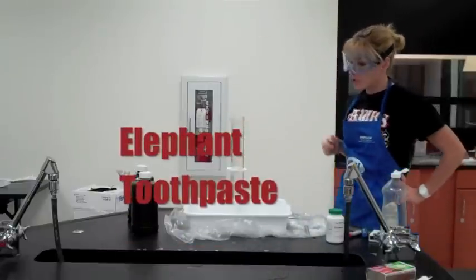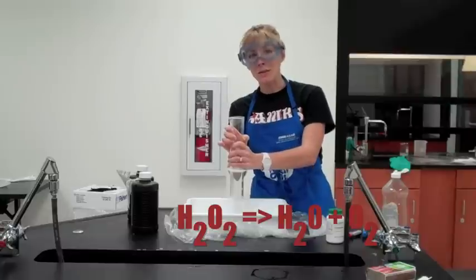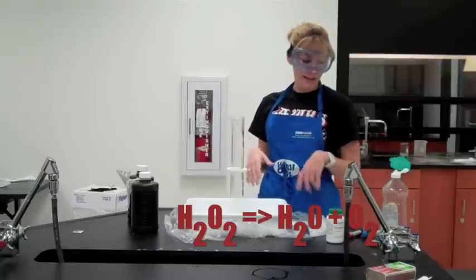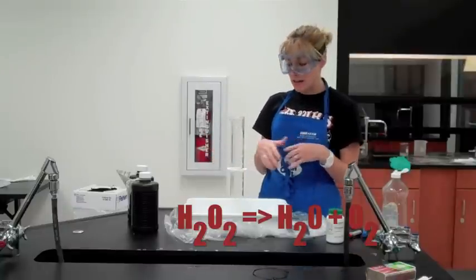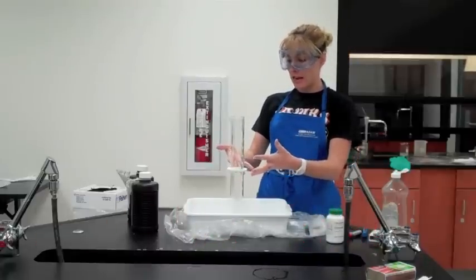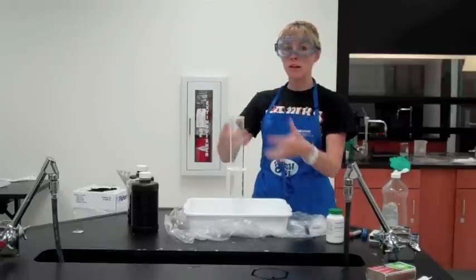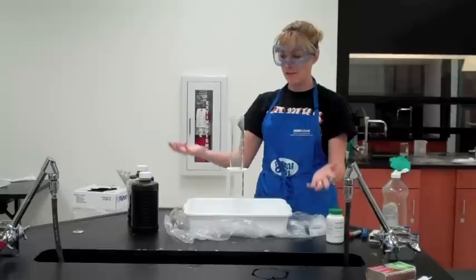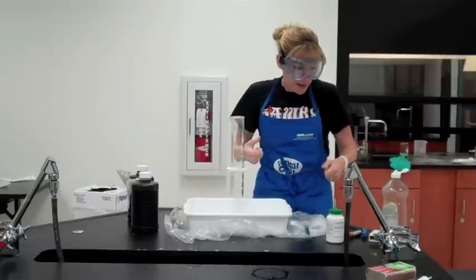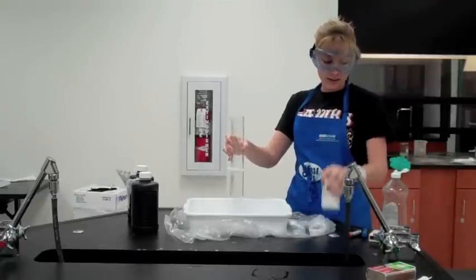For this next demonstration we're going to do what's called Elephant Toothpaste. We are not actually going to make toothpaste — we're going to do a hydrogen peroxide decomposition, catalyzing it with potassium iodide. It's called elephant toothpaste because we capture the oxygen bubbles with soapy water, and all those bubbles take the soap and have it come out the top — looking like you took a giant tube of toothpaste and squeezed it. First we'll get set up, make our soapy water, and get our catalyst in there.